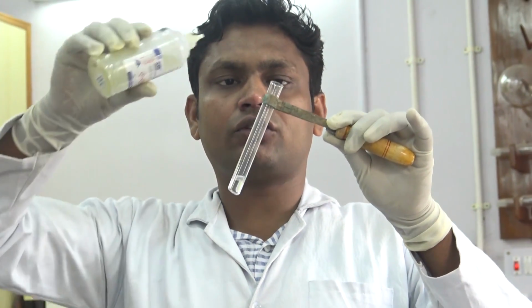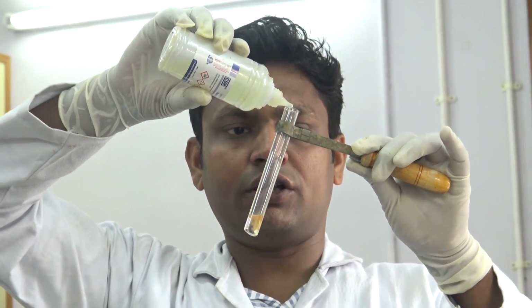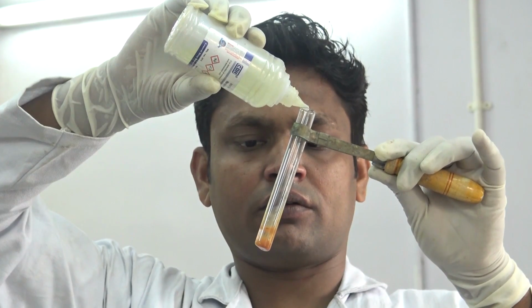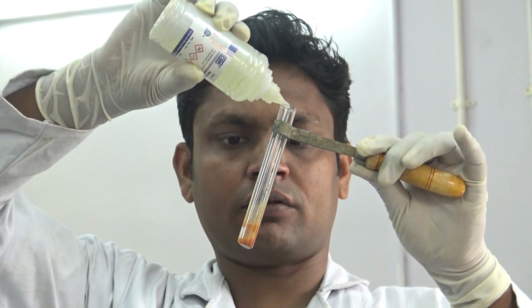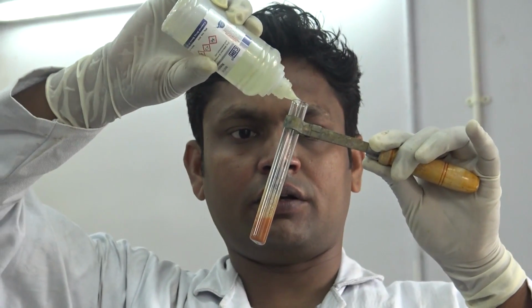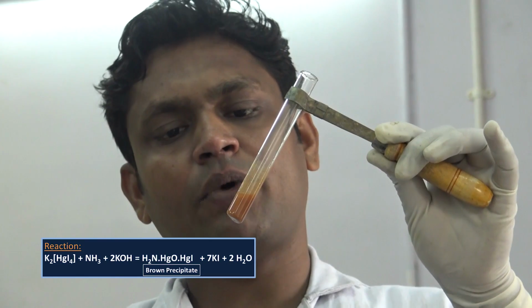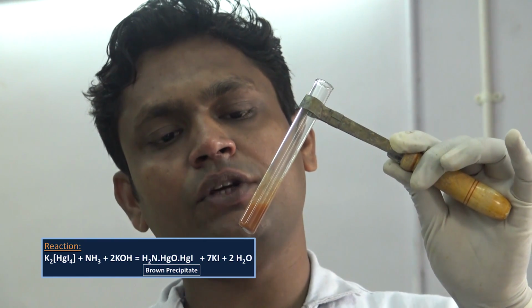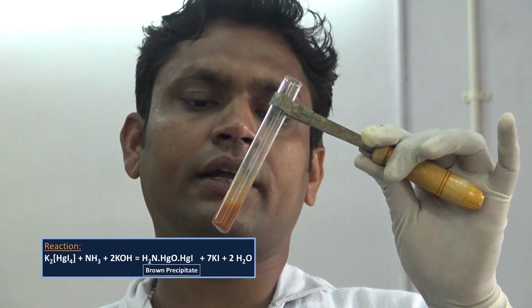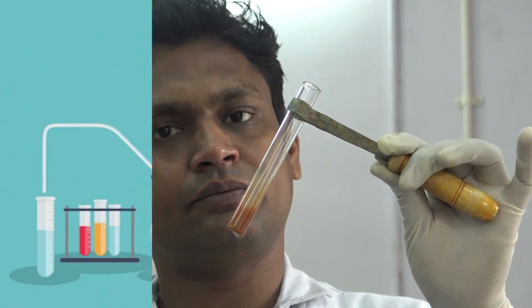After dissolving the salt, add a few drops of Nessler reagent into the solution. Formation of a brown precipitate confirms the presence of ammonium ion in the solution. Hence, our sample may contain ammonium cation as a basic radical.